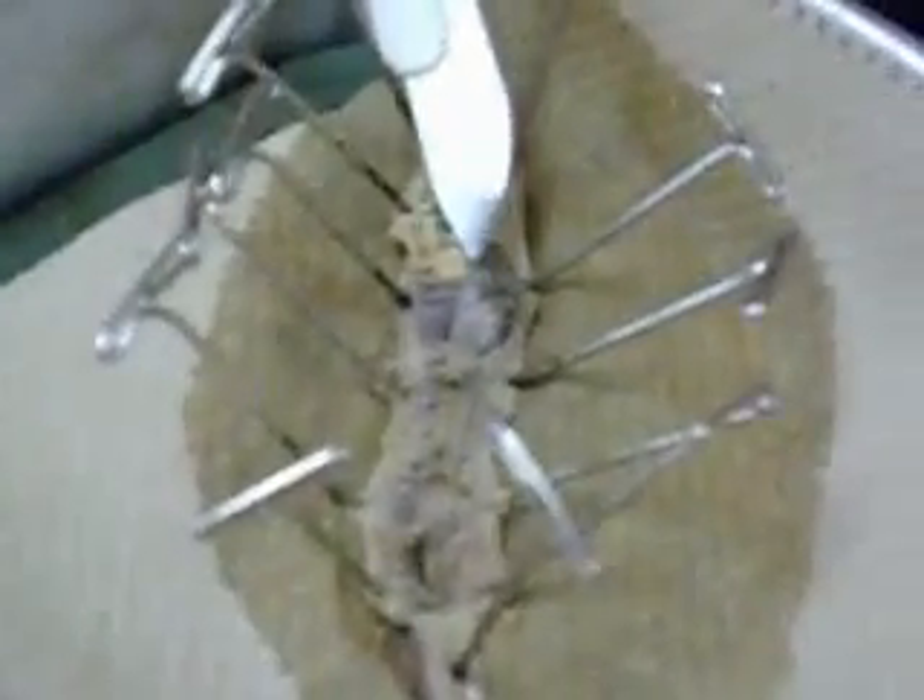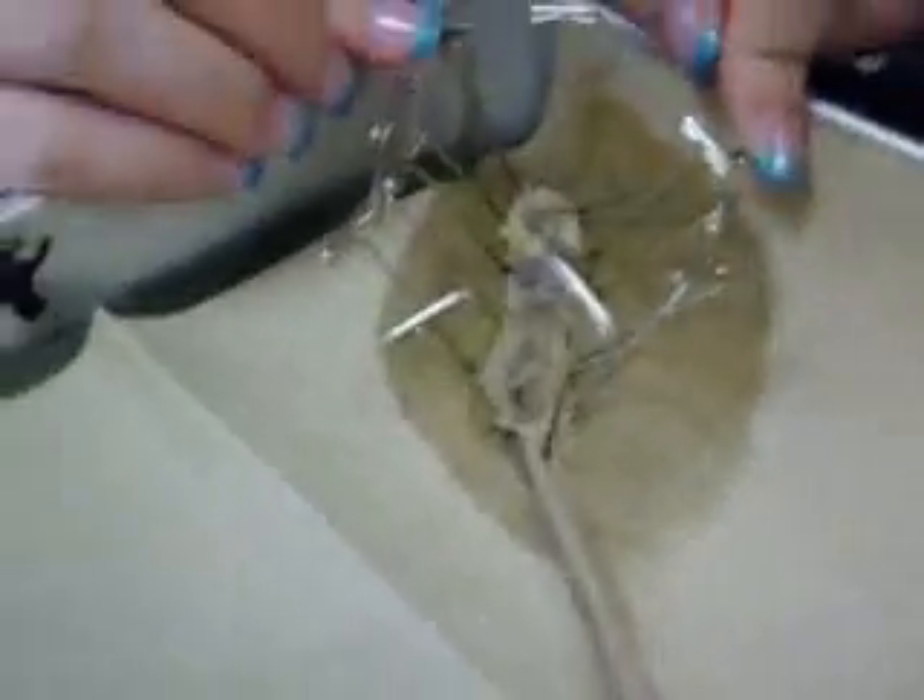That little ball thingy right there that she's pointing at — that's the seminal vesicle. We're all grossed out. This is disgusting and nasty. No one should ever have to do this. We're never going to use this in our lives.